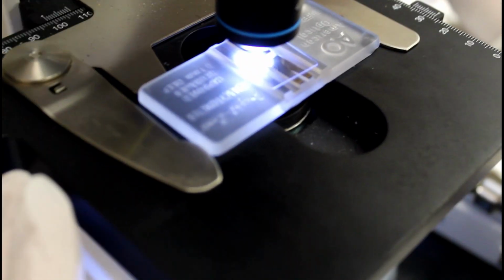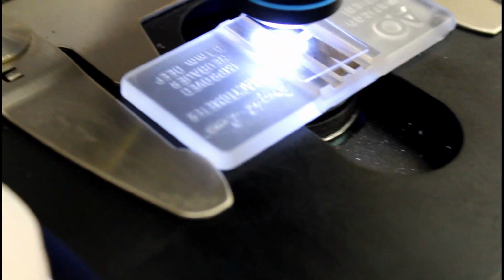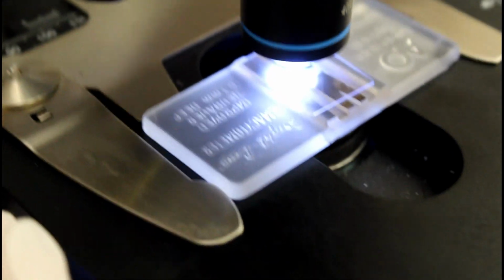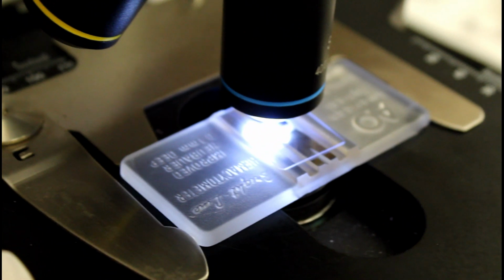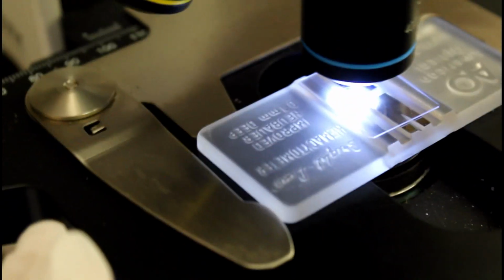Your counting should be done in a consistent pattern, starting from the left and proceeding to the right, dropping down 1 row, then right to left, drop down 1 row, then left to right. Use this same pattern in all 4 corner quadrants. Again, count both live and dead cells, as well as enumerate the squamous epithelial cells.